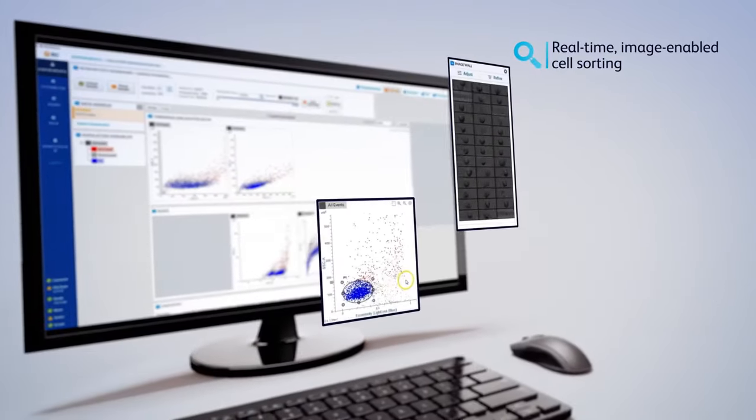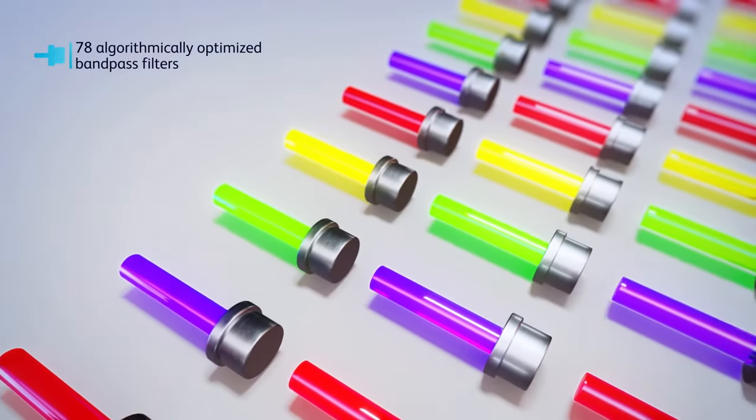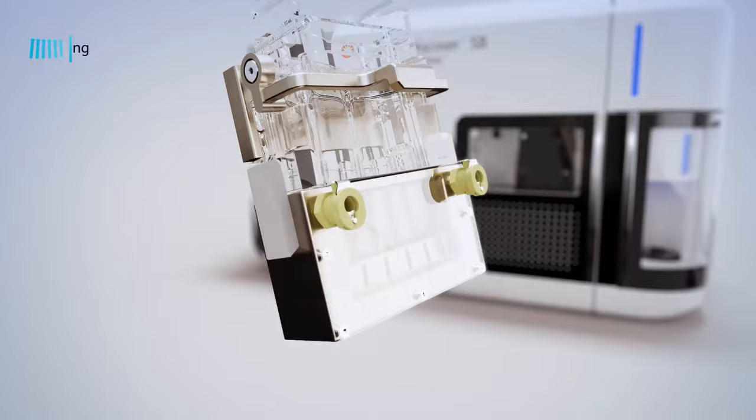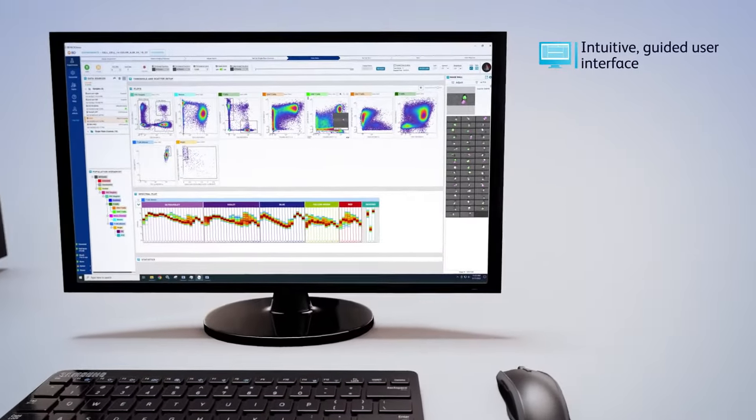Gain from real-time image-enabled cell sorting, 78 algorithmically optimized fluorescent detectors, 6-way sorting, and an intuitive guided user interface.